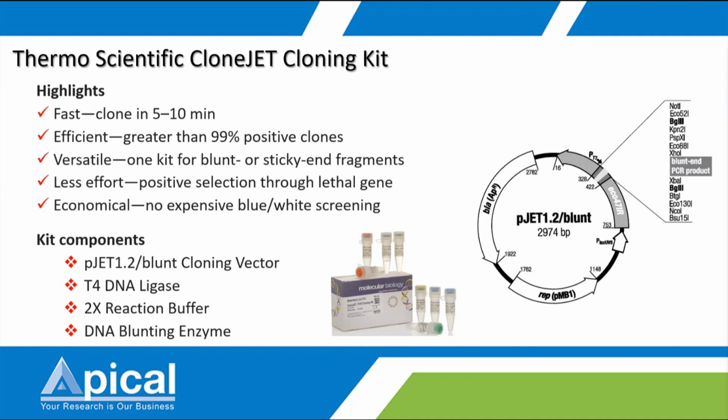So the vector pJET1.2/blunt is specially constructed with a multiple cloning site. In the middle of this, there is a lethal restriction enzyme gene, the eco47IR gene.